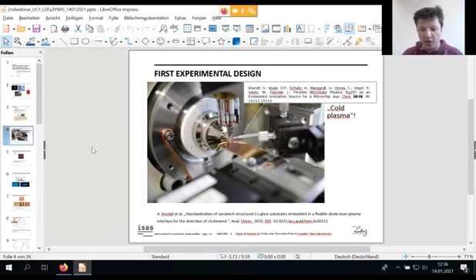The laser diode is actually very small. The housing is basically the biggest part of the laser. The housing is just to keep the light of the laser away from the user. But the laser diode itself is very small. It's like this big.